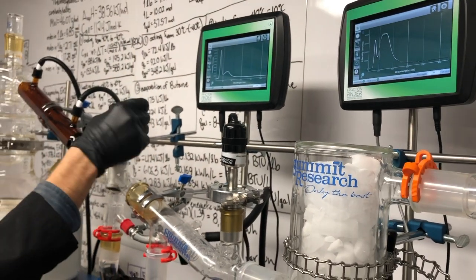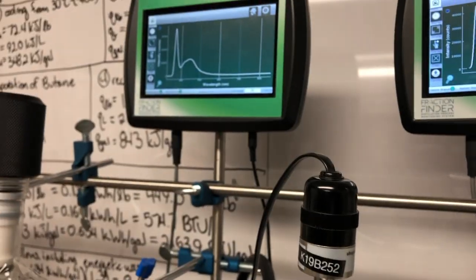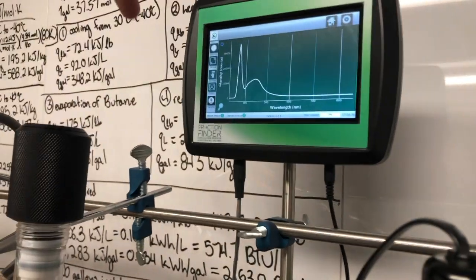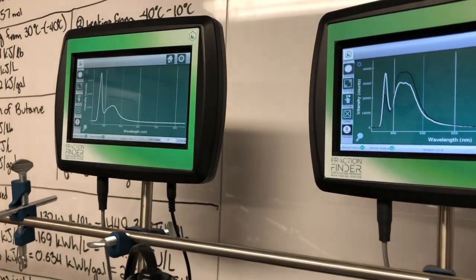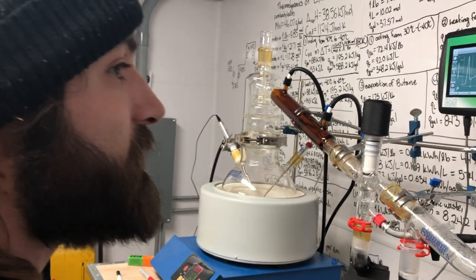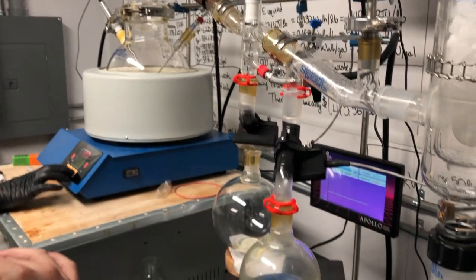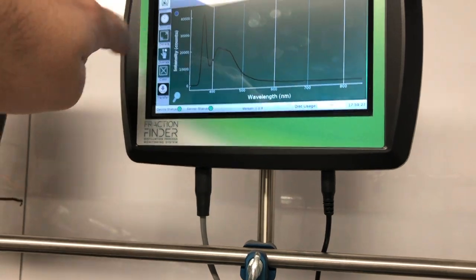Actually, dude, look at that. You're getting less 410, more 460 on this side. That does have significantly less 410. Look, you're getting barely any 410 now. It's a little tiny side bump as opposed to being the mass dominant peak. Right here, that's 460. A little bit of 410 in there, a smidge, a little shoulder. That's why I turned the temp up, to give us some more push and hopefully push those heads past it.